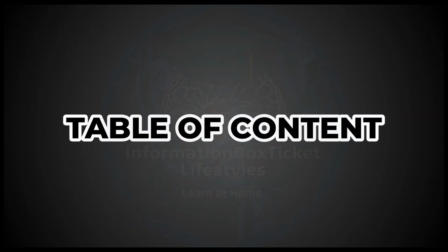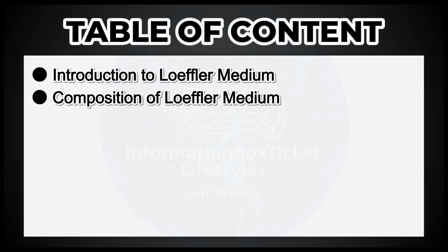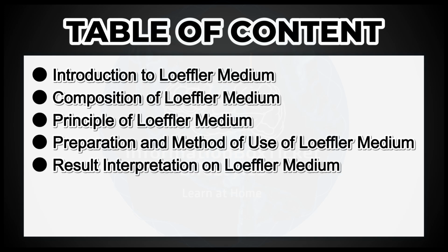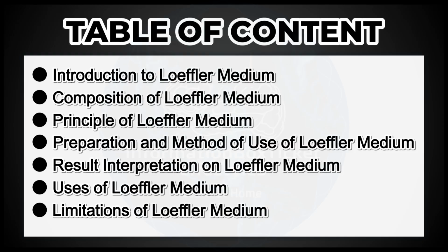Table of Contents. Introduction to Loeffler Medium. Composition. Principle. Preparation and method of use of Loeffler Medium. Result interpretation on Loeffler Medium. Uses of Loeffler Medium. Limitations of Loeffler Medium.